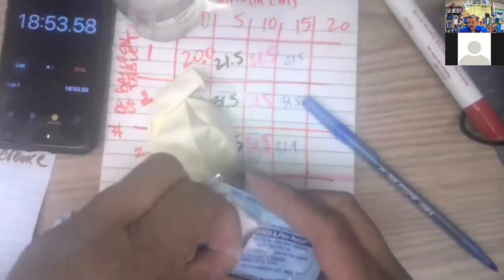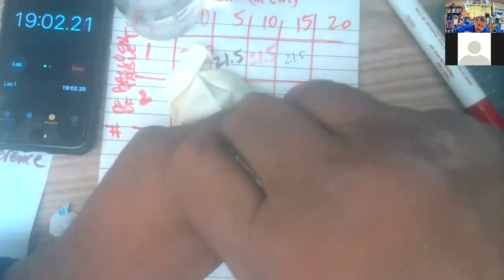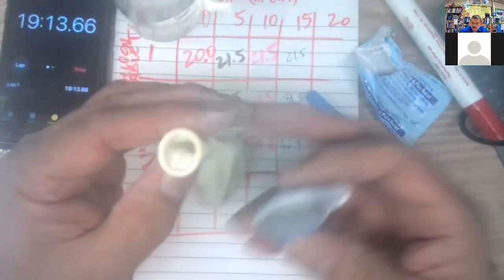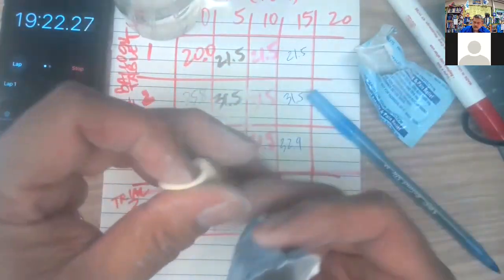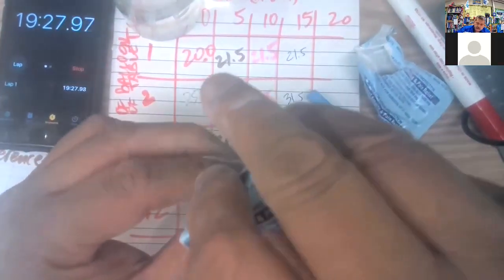So pour it in, so 2 tablets worth of Alka Seltzer. Most of it in there with that first pour. There's some more. And watch the clock because I'm probably just going to pour this in here and add the water after we do our last measurements.